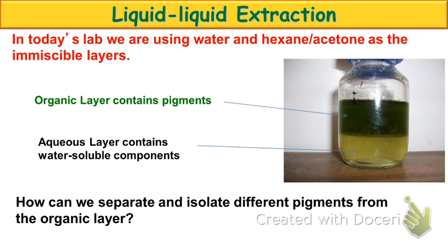We can only use a very, very small amount. You guys use those microcapillaries, or at least that's what you should have used to spot your TLC plates. Those release pretty much a drop of liquid. By a drop, we're looking at 1 microliter. Okay, if we take a look at this figure, how much liquid do you think is in that layer? A lot. It's a heck of a lot more than 1 microliter.